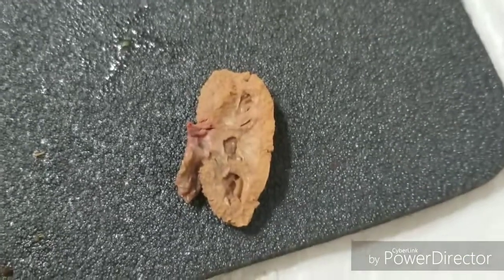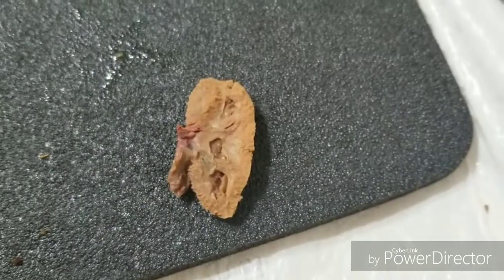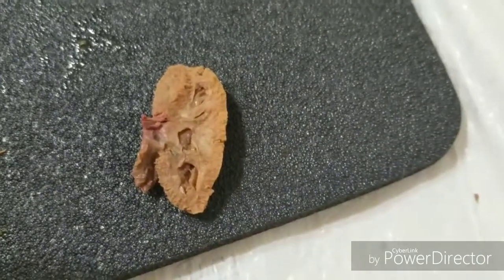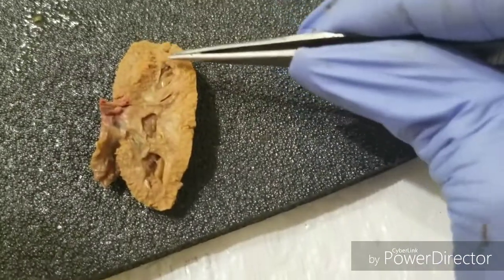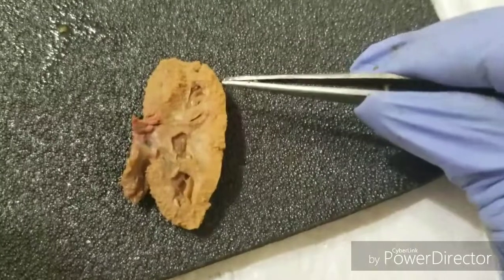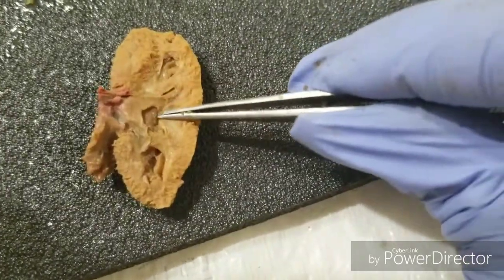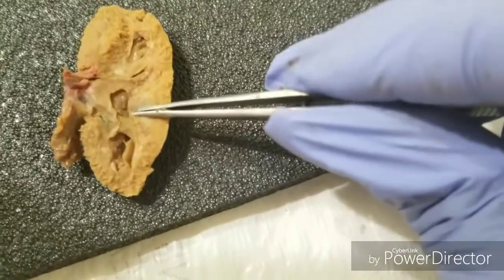I'm just going to look at the cross-section of the kidney. I changed the view of the camera so we can be closer to the structures that we're going to be looking at. I will be pointing with my tweezers. So we're going to start with the renal cortex, which is the outermost layer of the kidney. Moving inferiorly, or moving deep, we have the renal medulla, which are darker in color because they contain the renal pyramids. And the renal pyramids have the capillaries as well as the collecting ducts that help retain water.